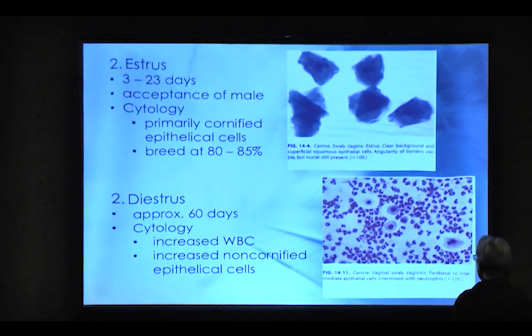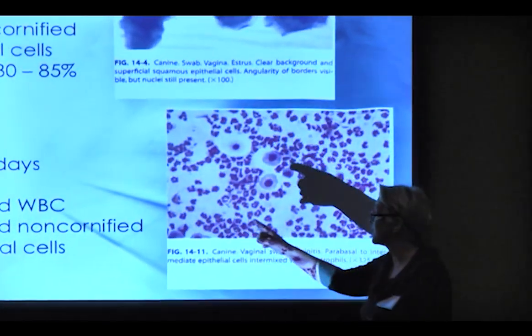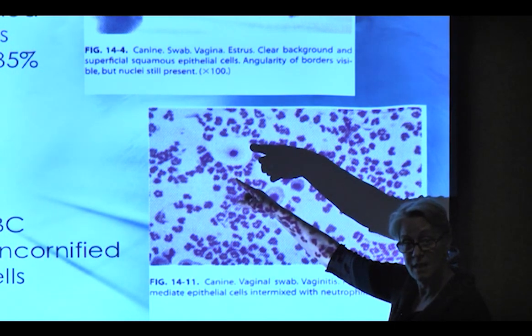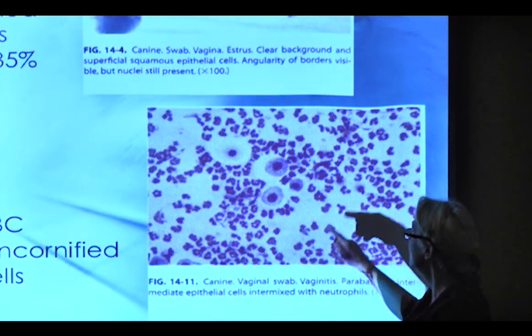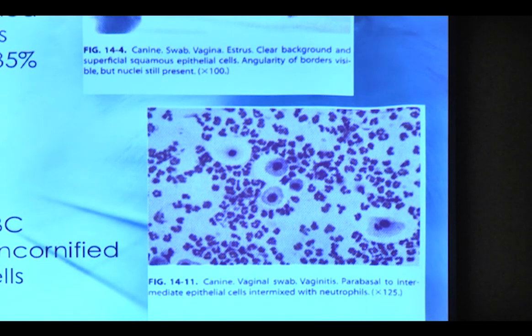Now, diestrus means it's all done. As soon as the bitch is done with her receptivity, diestrus means it's all done. You got some more of those big cells with the big circles in the middle of them. The epithelial cells are like that. There's another big cell, okay? The other thing you have, see all these things out here? Those are all white blood cells. Those crinkly looking things out there are all white blood cells. And that's when you get in diestrus. As soon as that one's over, this is what happens. And then you know you're done breeding. Don't breed anymore, because you're just wasting the sperm.